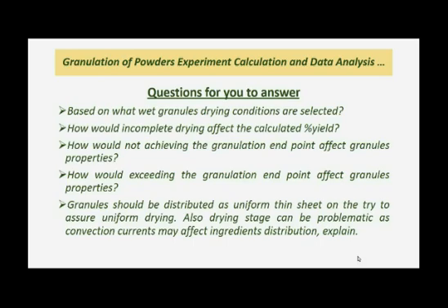How would exceeding the granulation endpoint affect the granules properties? Again, this will affect the granules properties by ending with relatively hard granules relative to the ideal hardness at the correct endpoint, and this will cause the calculated theoretical weight to be higher than expected.